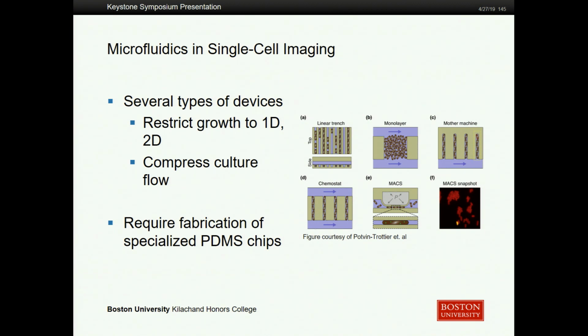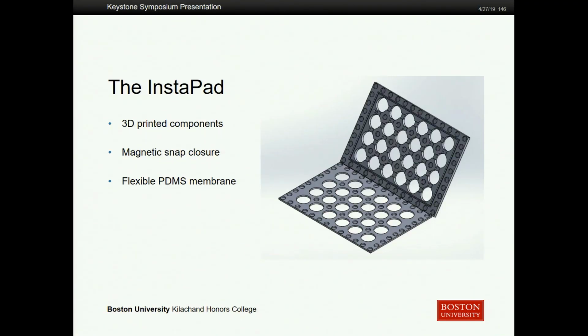There are a couple of issues with this. One, it's not really available in a commercial format. You have to design these PDMS chips yourself, and we wanted to take this principle of trapping cells with pressure and put it in a commercial format. So that's where we come in with this project. We are dubbing it the Instapad. I didn't come up with the name. That was already existing when I signed on to this project.